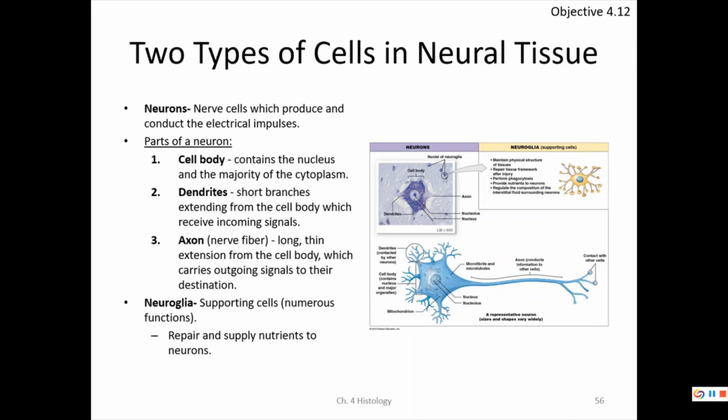I'm Batman. And the neuron has a cell body. The cell body is this big part here. Dendrites are these branches that look like trees coming off of the cell body, and the thin extension here is called an axon. Now, one of the things is I might have this picture here for nervous tissue, but I'm going to give you a blank version of this neuron and have you identify things like cell body, dendrite, or axon.